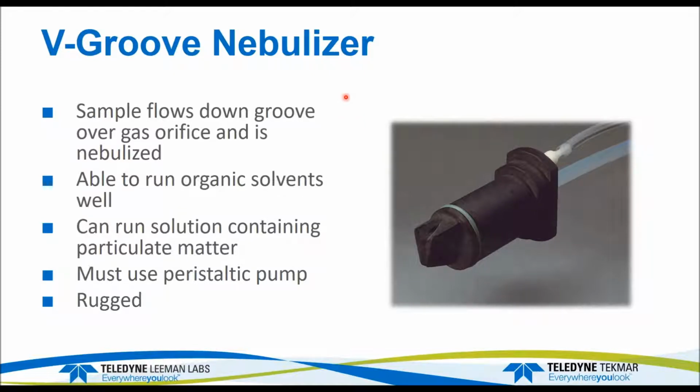is designed specifically for organics. It's not meant to be used with aqueous samples. There are V-grooves available that will run aqueous and organic samples. Typically, a lot of times V-grooves are used for high levels of dissolved solids in aqueous or HF type solutions.